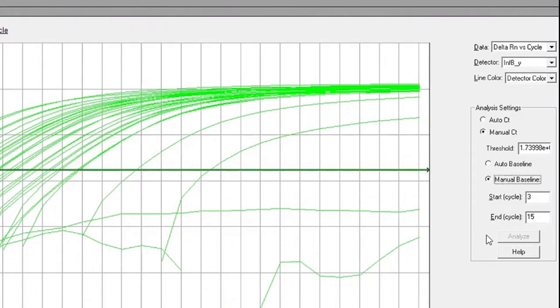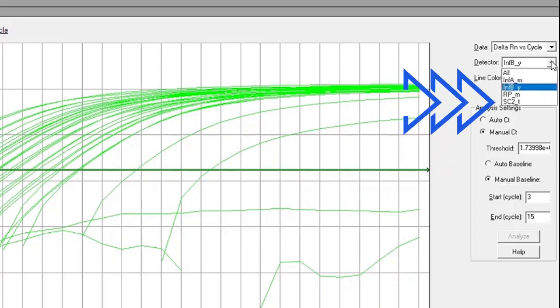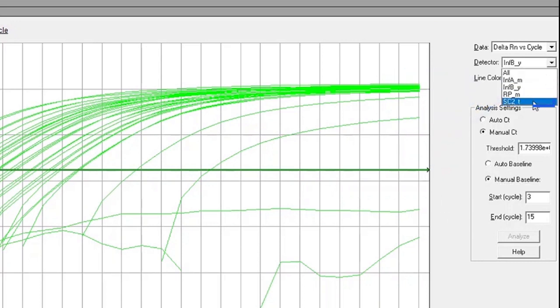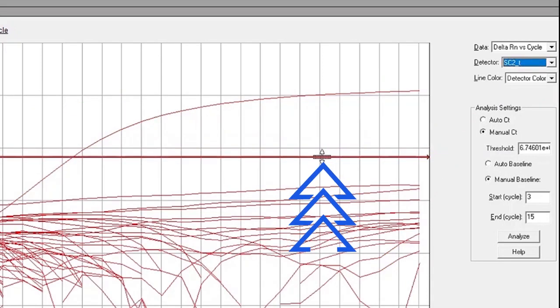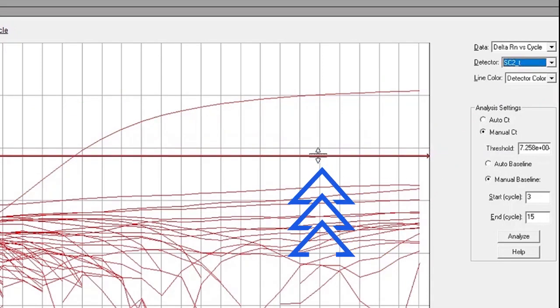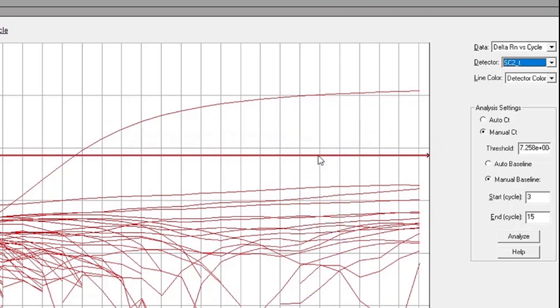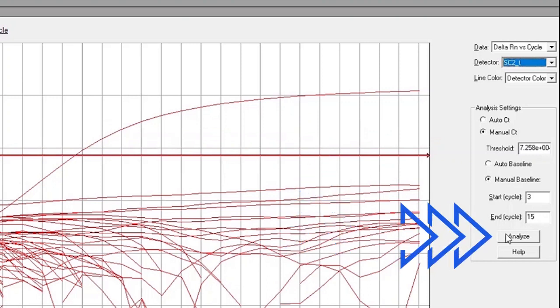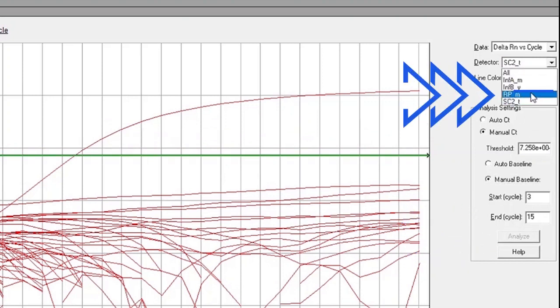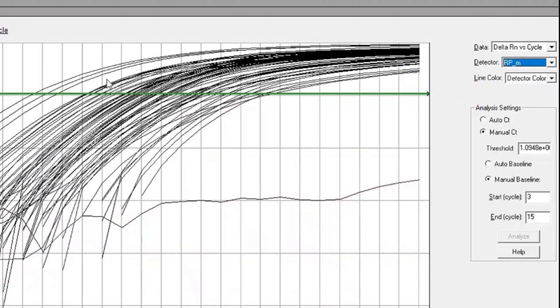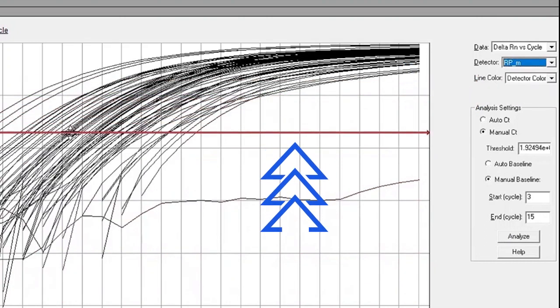Continue this process for the SARS-CoV-2 assay by selecting the SC-2 detector in the drop-down menu, adjusting the threshold line, and clicking Analyze. Finally, select the RNAs P detector in the drop-down menu, adjust the threshold line as before, and click Analyze.